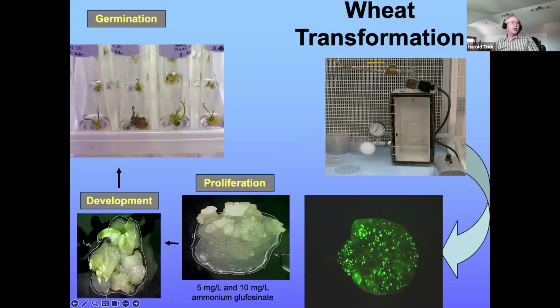Okay, so this is the gene gun. Essentially what happens is we'll have our culture material in our Petri plates. We will put that in the bottom of the gene gun. Your DNA, we mix it with tungsten, which gives it weight. We will put that into a little Swinnex filter up on top. And then when we apply a vacuum to a certain point, we'll hit a button. We drive this through by using helium. And that shoots your DNA into the tissue.